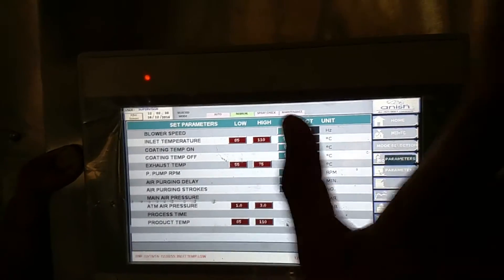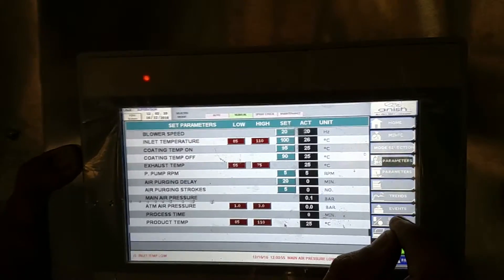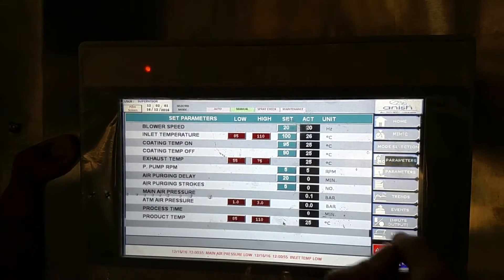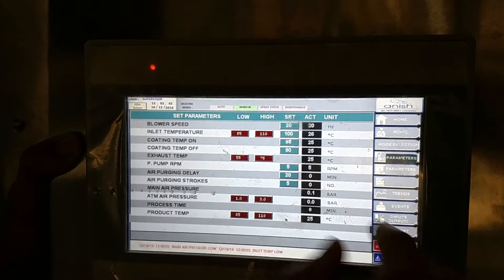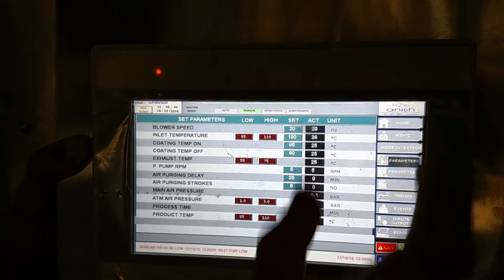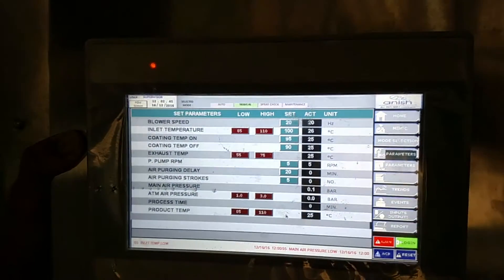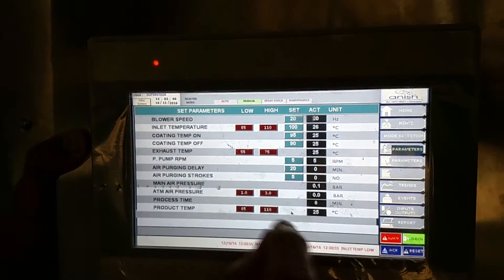Then process time. In manual mode we cannot set process time directly because it is operated manually. We can turn the system off and on whenever we want. In auto mode, we have to set the process time — the complete process time — and then production.